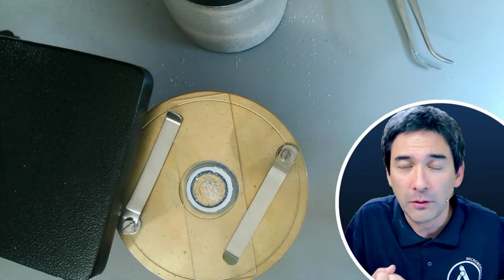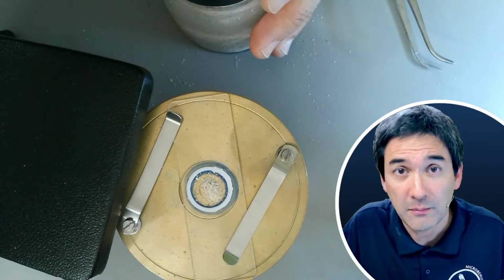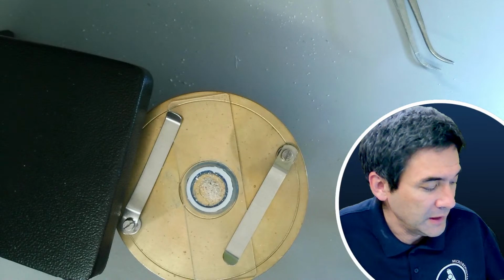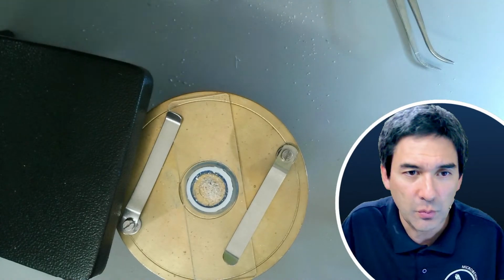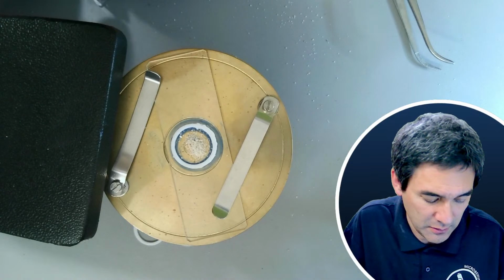So it soaked up all of the nail polish, and it did not stick to the slide, because there was simply not enough nail polish between the cardboard and the slide. So it didn't work, and this is why those plastic 3D printed rings are actually more suitable.